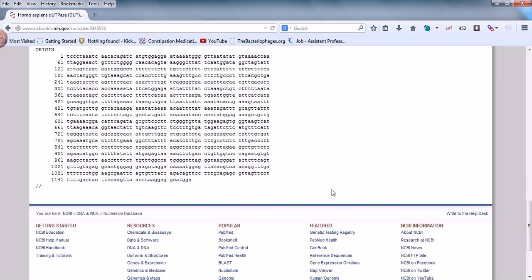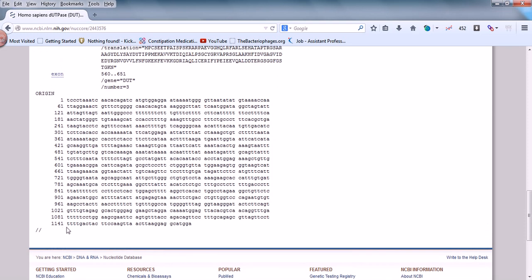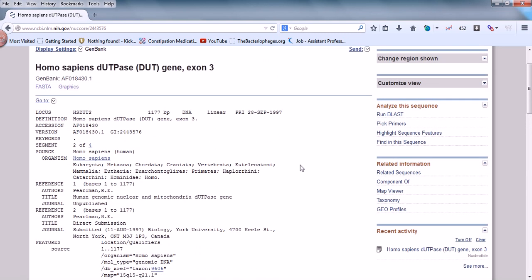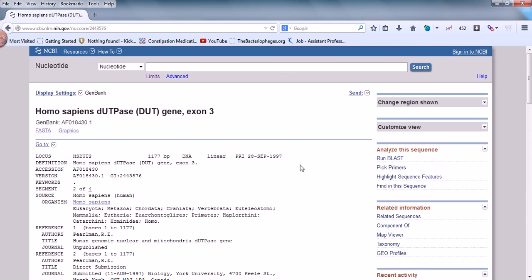Finally, the gene sequence from 1 to 1177 is the exact gene length, and that sequence remains constant. What varies — due to alternative splicing — is the production of mRNA. The exons included vary, leading to different varieties of proteins or polypeptide chains. Eukaryotic DNA and the eukaryotic genome are much more complicated than prokaryotes. This accession number is what you need, and that's how you can get the information. I hope that's helpful — thank you.